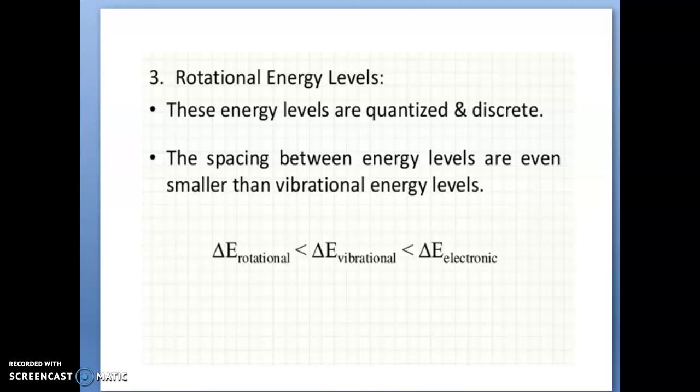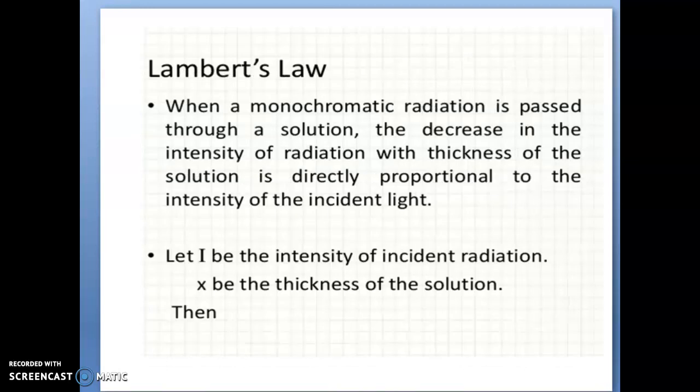Next are some laws that spectroscopy obeys. The first one is Lambert's law. What is Lambert's law? When a monochromatic radiation is passed through a solution, the decrease in intensity of radiation with the thickness of the solution is directly proportional to the intensity of the incident light.